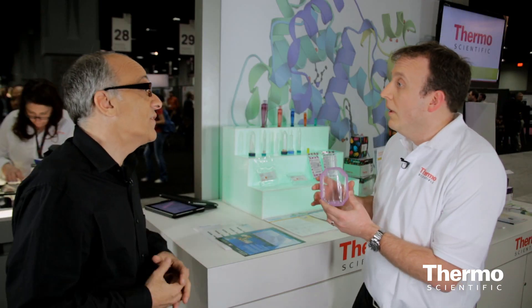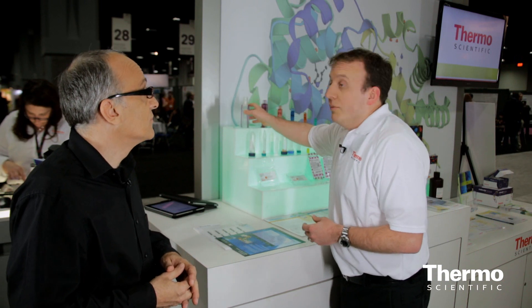And the alternative if someone's not using this? Well, at a larger volume, there's not a lot of other opportunities. So the slide-alyzers, especially at this volume, are one of the sole solutions for that. In smaller sample sizes, we do have other desalting columns and other ways to change the buffer, but for larger volumes, this is one of the best options out there.